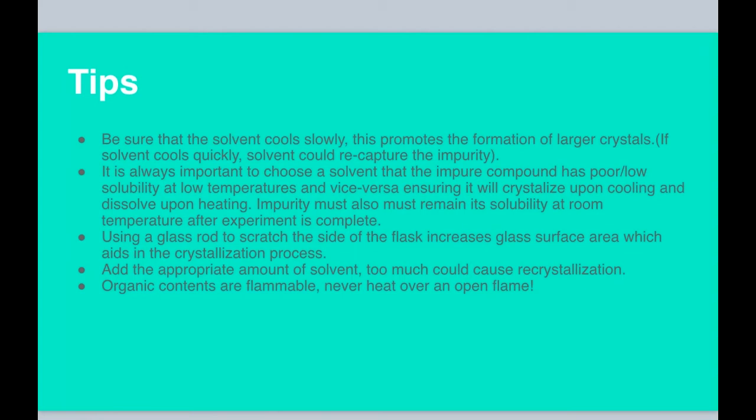Using a glass rod to scratch the side of the flask increases glass surface area, which aids the crystallization process. Add the appropriate amount of solvent; too much could cause recrystallization. And as the video mentioned, organic contents are flammable, so never heat over an open flame.